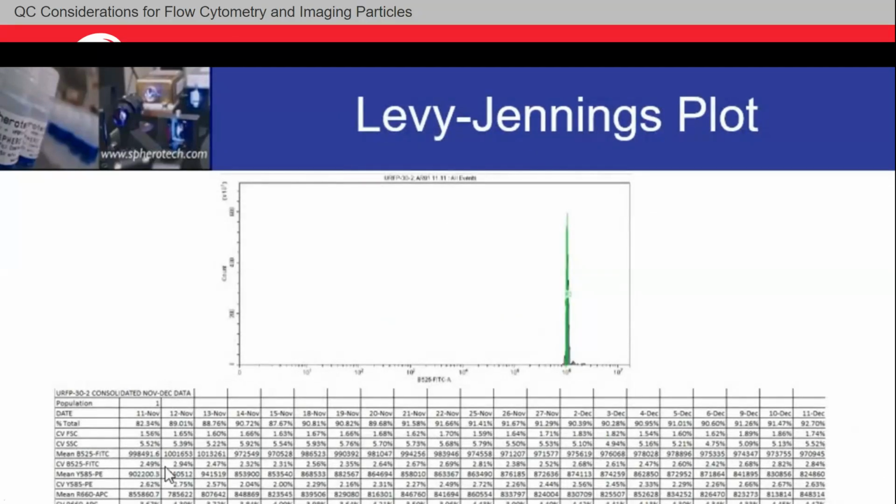I want to see if this is 2.5, 2.9, 2.5, 2.3, 2.3, 2.5, 2.3, very regular. Very, very regular, right? The MFI values.